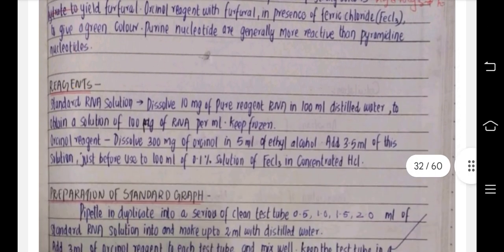Reagents: standard RNA solution. Dissolve 10 mg of pure reagent RNA in 100 ml distilled water to obtain a solution of 100 μg of RNA per ml. Keep frozen. Orcinol reagent: dissolve 300 mg of Orcinol in 5 ml of ethyl alcohol.